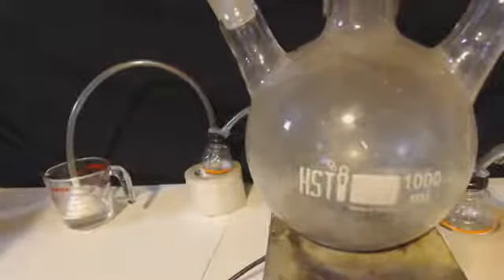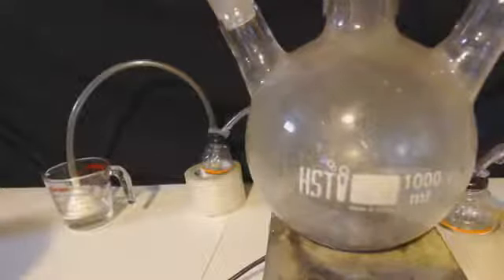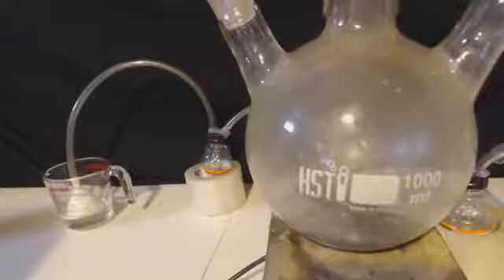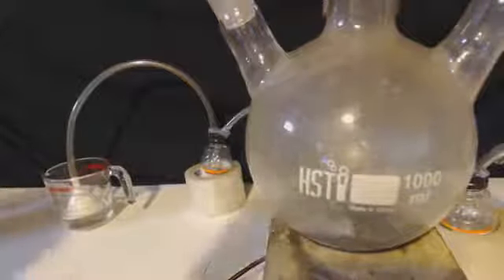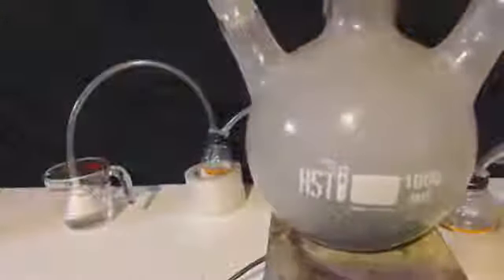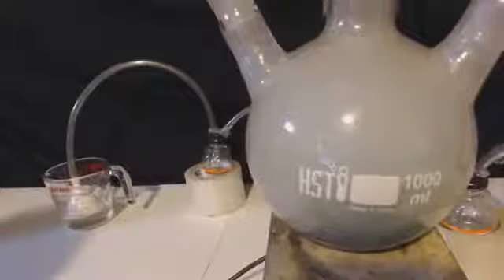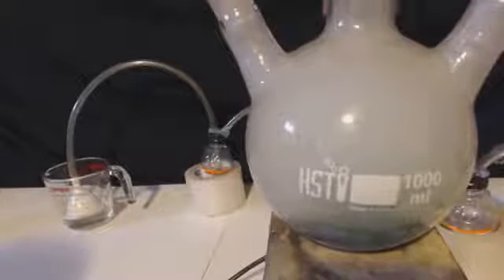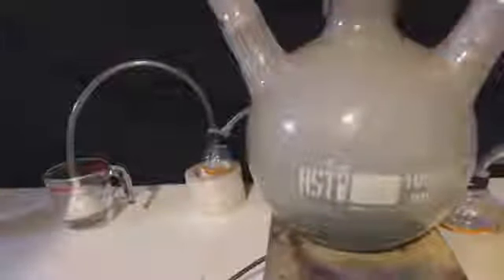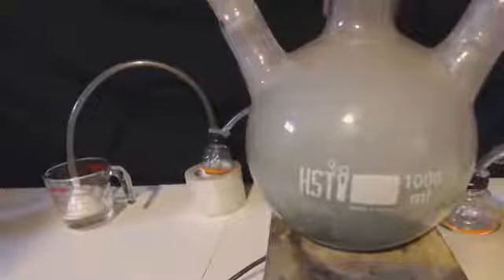Now at this point, I'm thinking it should be bubbling through there, and I don't see any bubbles. Now I'm starting to get paranoid. I wish I would have left the volume on for this, because what happened was it built up all this pressure and popped off the cap onto the top there. It smashed it in. I mean, it was loud. A big pop. Scared the heck out of me. And I broke the keck clip, the piece of plastic that holds on that cap.